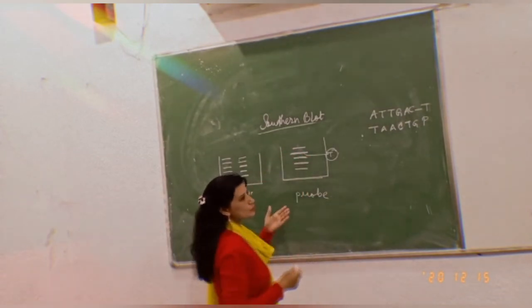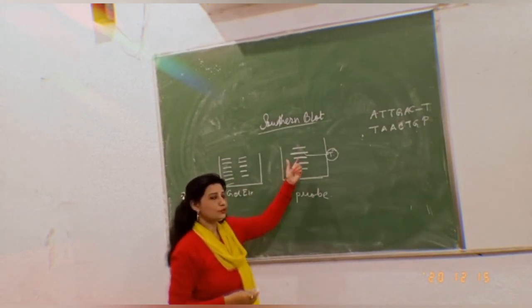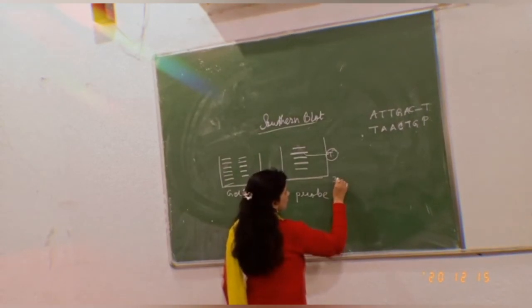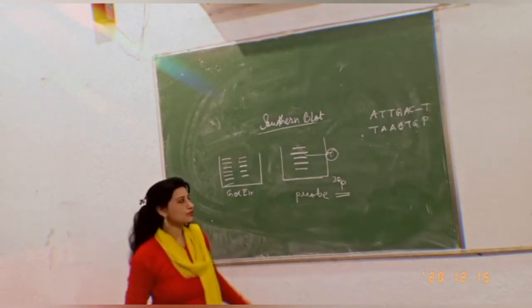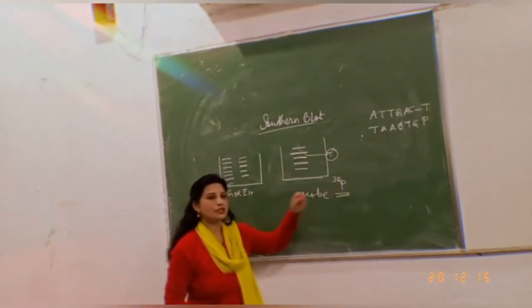Now here, if I am exposing to the UV rays, I can get it. It will locate. I will be using P32. This is a radioactive isotope. I will be using phosphorus 32, because it is also present in the DNA molecule.